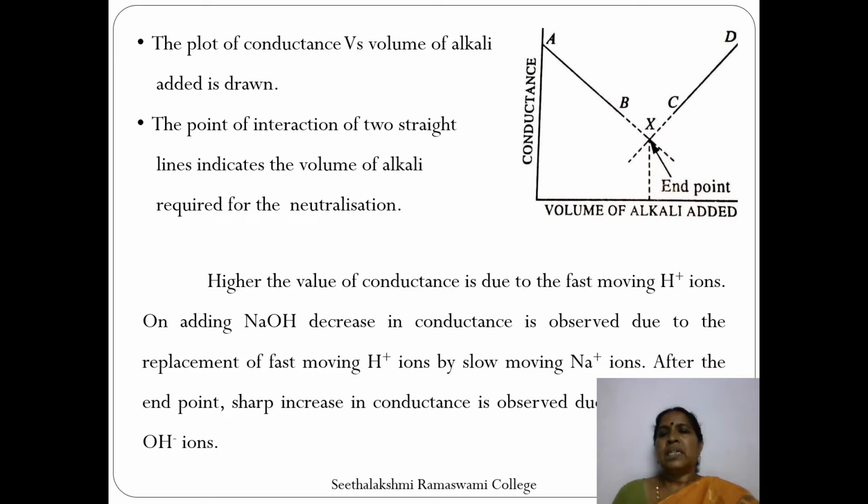The initially high value of conductance is due to the presence of fast moving H plus ions in hydrochloric acid. Then conductance decreases.